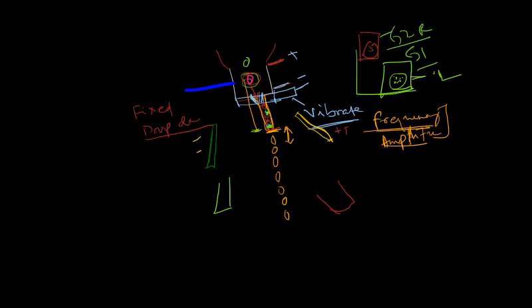Say we want to sort the green cell. Consider the green cell at the edge of the stream. The moment it is at the edge, in the next step this cell is breaking off from the stream and goes into the droplet. So on a flow cytometer we never sort cells per se, we sort droplets that contain the cell of our choice. As the drop breakup is happening, the droplet carries the cell.